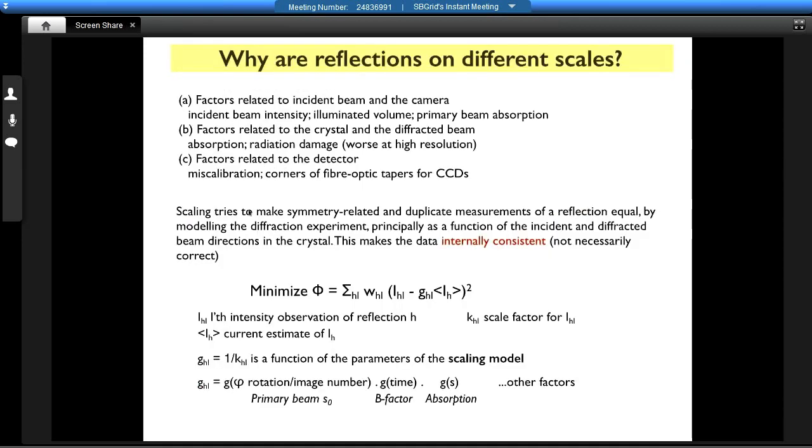I'm rather impressed by the algorithms that Kay and his colleague came up with for resolving this ambiguity in the case of XFEL data, which is much more difficult because you have little tiny fragments of data. This algorithm works well where each bit is pretty much complete. None of this stuff works well for things like XFEL data, where you've got a very large number of very small bits of data. They really need different algorithms to handle that sort of thing.